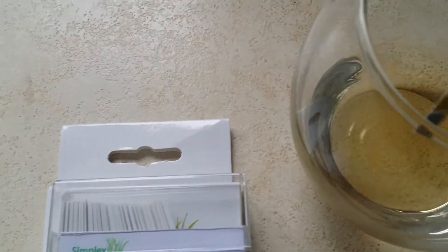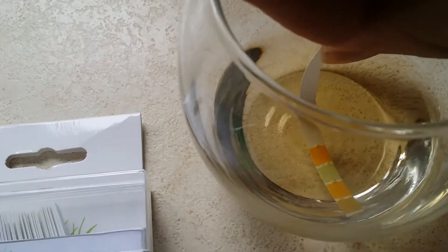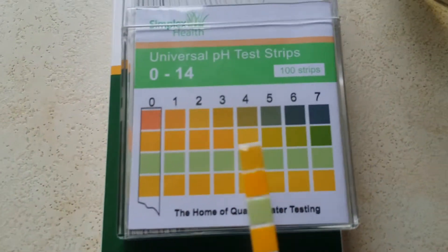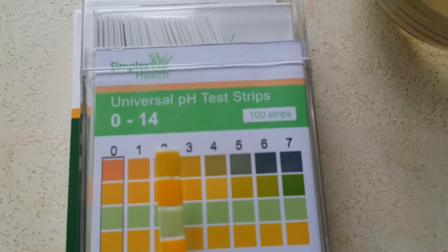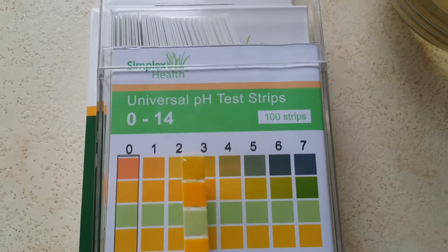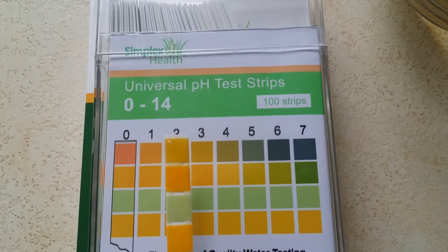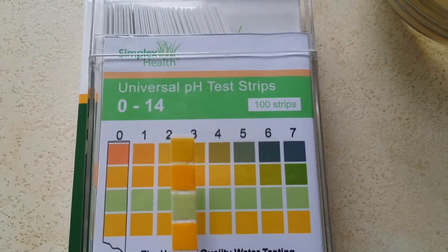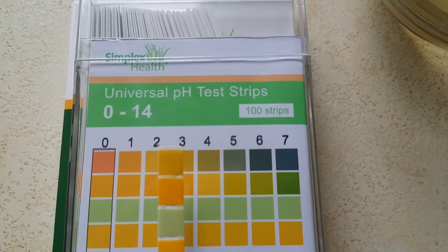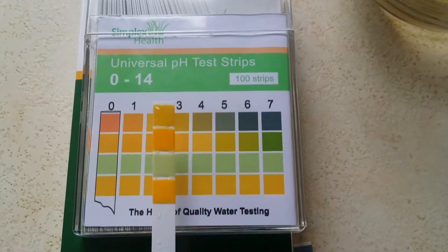All you do is you dip it into the solution, take it straight out — it only has to be in for about half a second — and then you match it against the chart. As you can see, the strip changed straight away to quite an acidic pH, as we expected. From that, you can see it's matching pretty much to the 3. You could even say it sits between the 2 and 3, probably about 2 and a half. But that is literally how you do it.